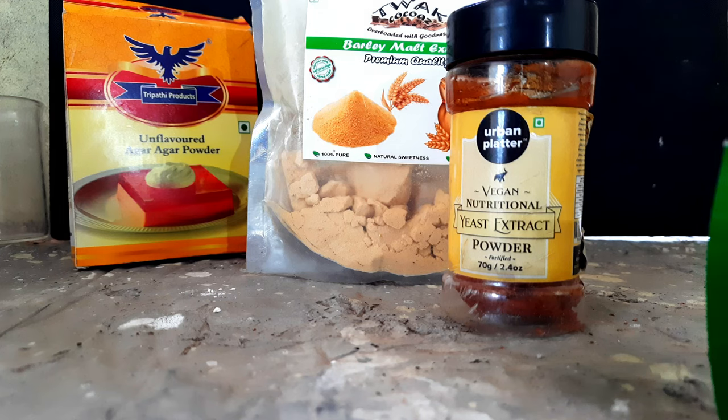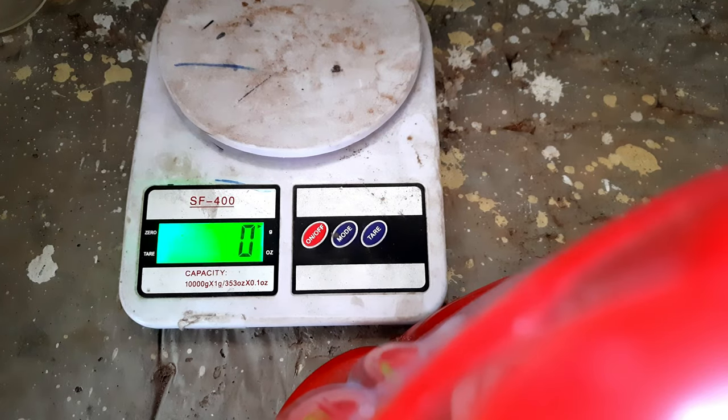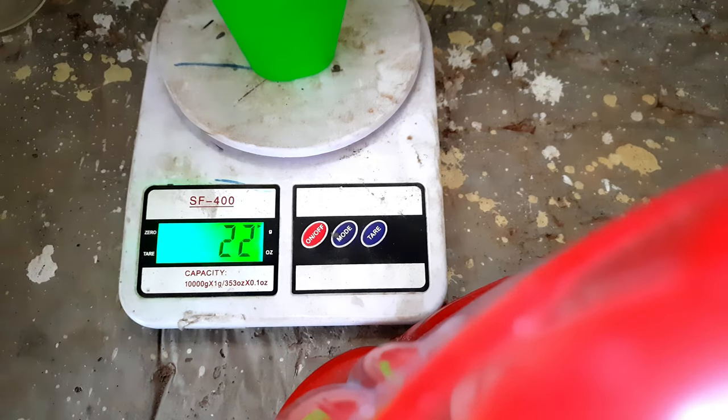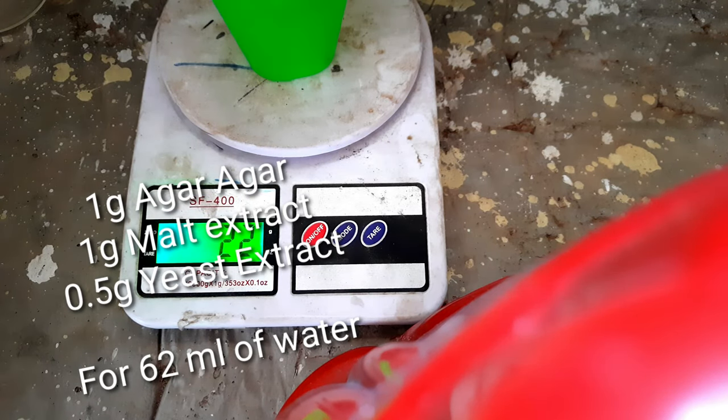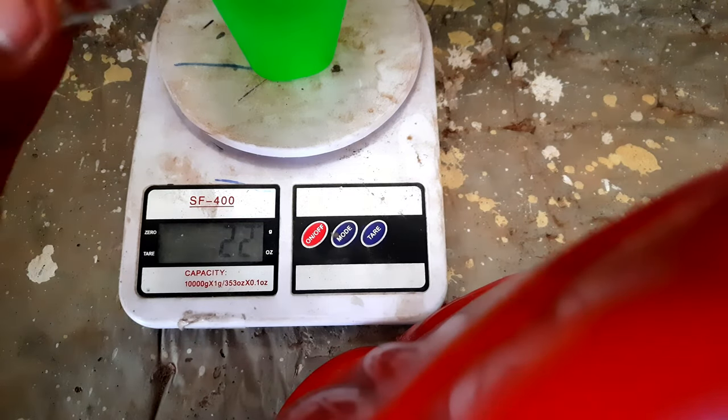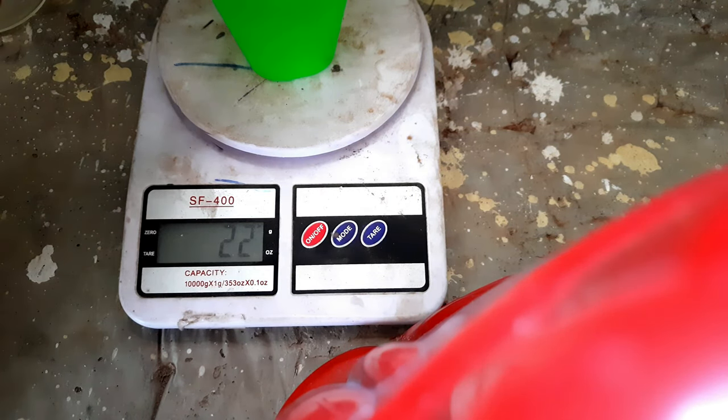If you don't have yeast extract, I'll soon be making a video on how to make it at home. So the goal here is to use one gram of agar agar as the solidifying agent, one gram of malt extract, and half a gram of yeast extract, dissolved in 62 milliliters of water — approximately one quarter of a glass tumbler.